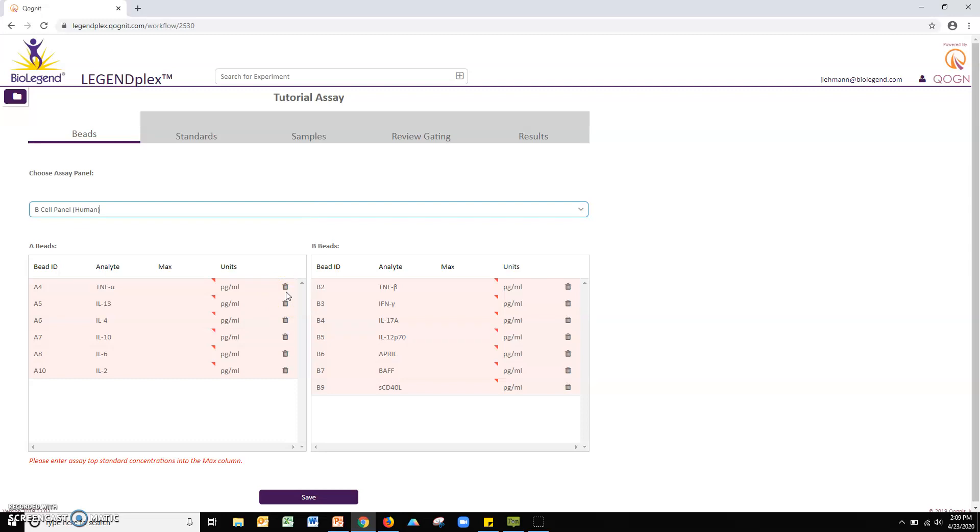If you are using a custom LegendPlex assay, select the custom panel from the drop-down menu. Note, you will need to manually define the bead IDs for each custom panel.